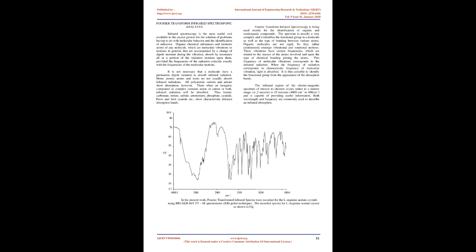Fourier transform infrared spectroscopic analysis. Infrared spectroscopy is the most useful tool available to the crystal grower for the solution of problems having to do with molecular behavior and the identification of unknown organic chemical substances and mixtures. Atoms of any molecule, whose molecular vibrations or motions are accompanied by a change of dipole moment during the vibration, absorb by resonance a portion of the radiation incident upon them, provided the frequencies of the radiation coincide exactly with the frequencies of the molecular motions. It is not necessary that a molecule have a permanent dipole moment to absorb infrared radiation. Monoatomic atoms and ions do not usually absorb infrared radiation.